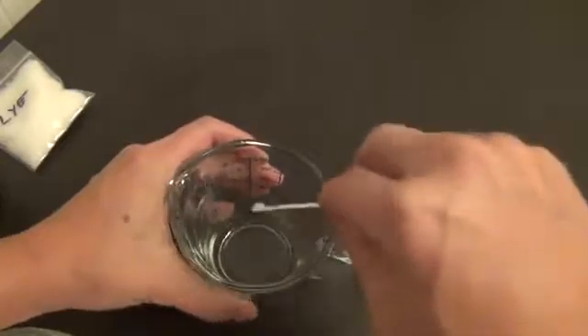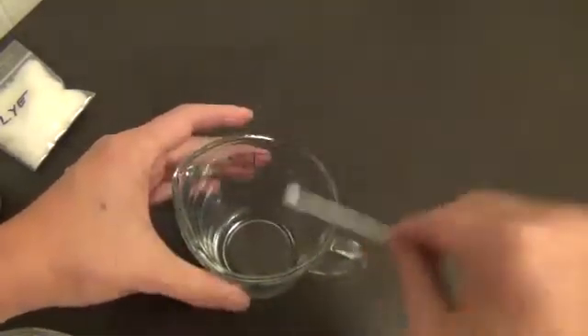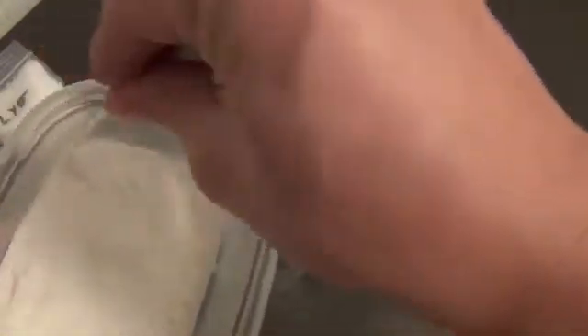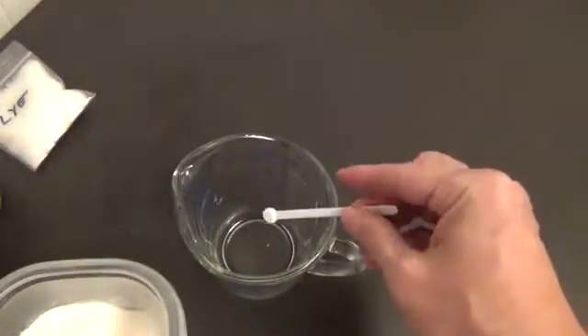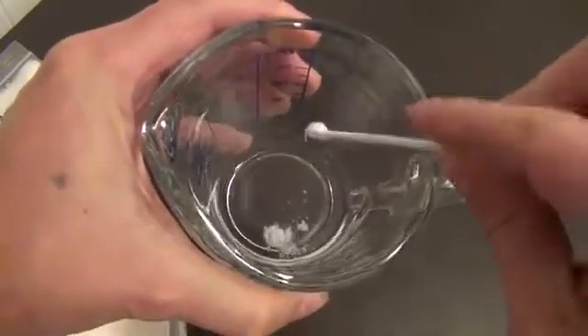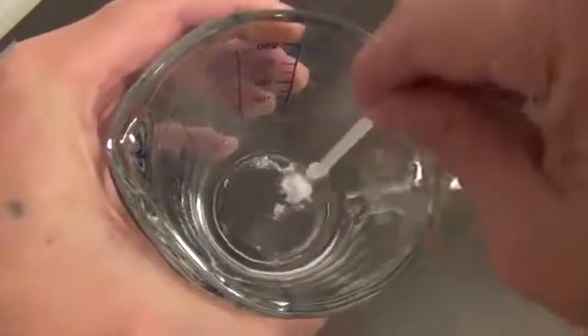Nice and dissolved. Get all the water off of that. Take our scoop of BAP and put it right on in there. Mix it up — let's see what happens.